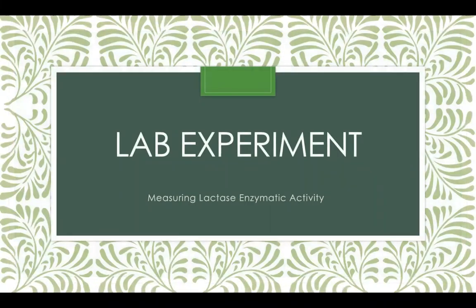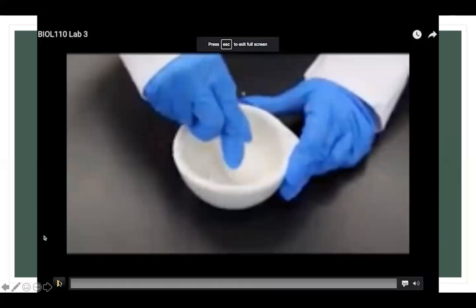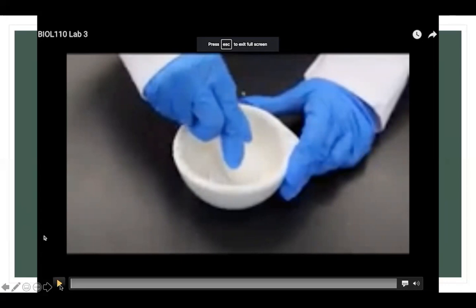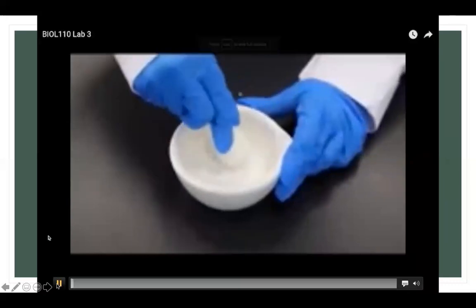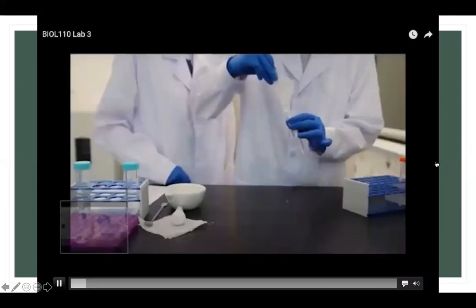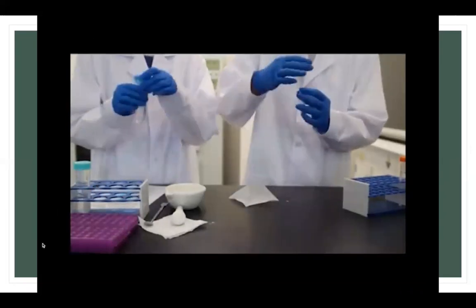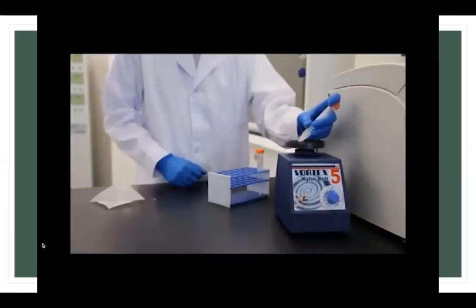And now we are going to do the lab experiment. It's shown by video. Let's see. First, extract the lactase by crushing the lactase tablet into powder. Then transfer it into the tube labeled suspension. Add 10 milliliters of 100 millimolar PBS buffer to extract the enzyme. Then vortex the tube for 1 minute.